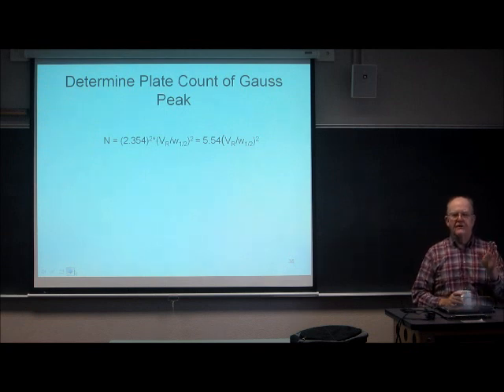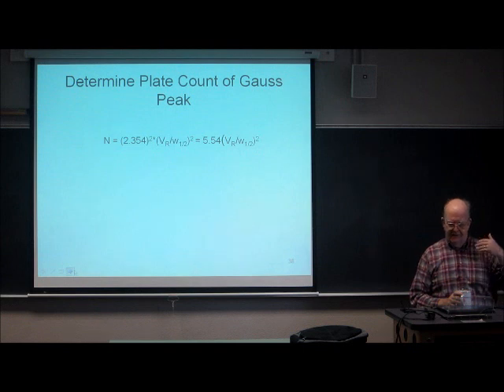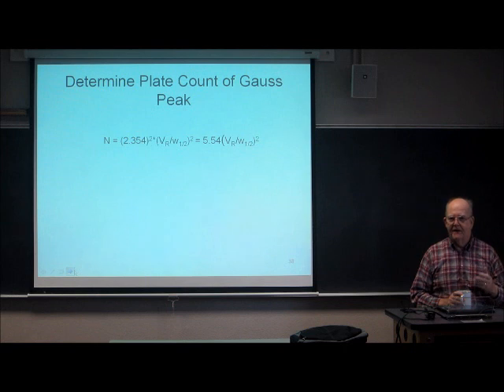Okay, now suppose you have a peak which is tailing. How do you calculate a plate count?